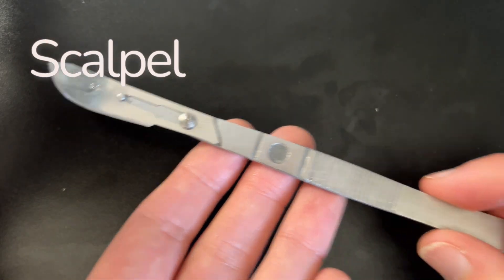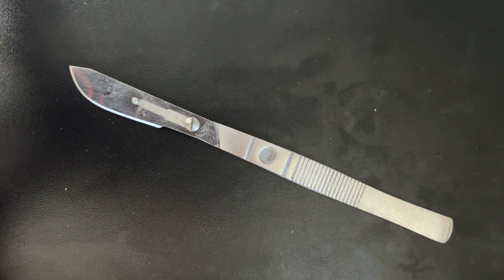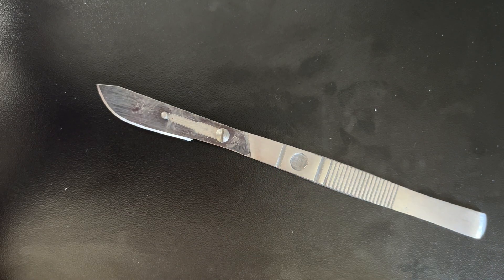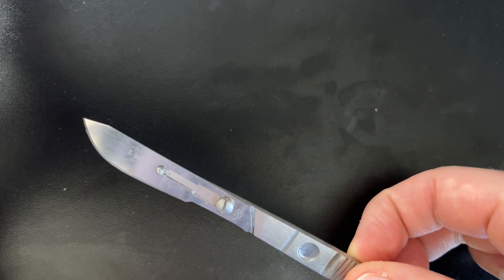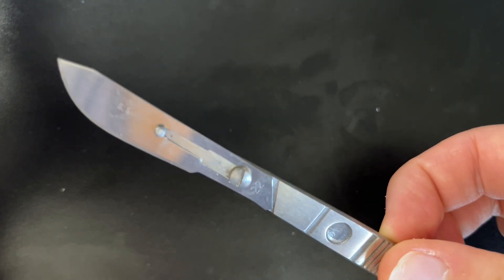Finally, we have the one you're probably thinking about most when you think about dissections — the scalpel. Remember, scalpels are sharp tools. You need to make sure the sharp point is away from you and use care when handling the scalpel with the blades. Scalpels are used for making precise cuts or incisions into our specimen, but in many dissections we do in class, we'll be using the scissors more often than the scalpel.